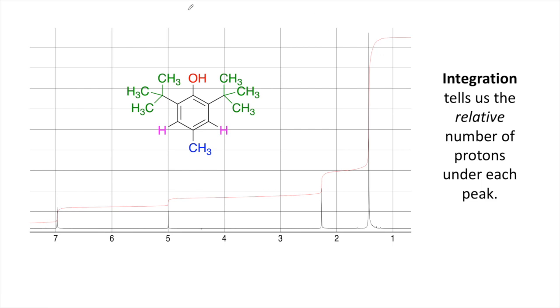Here, again, we've got our CH3s, not that deshielded. They're about 1.5, so they're a little bit deshielded by the rings, separate out here. This CH3 is a little more deshielded by this pi bond here. We'd expect it to be around 2, and it is.